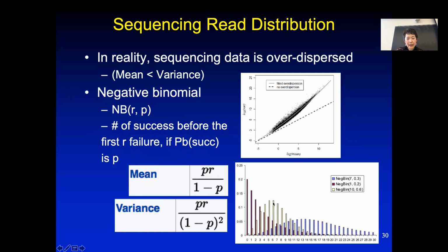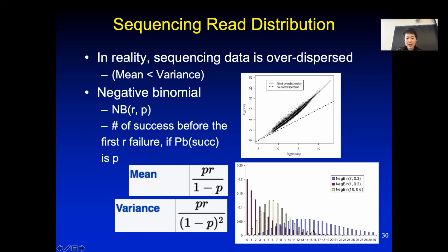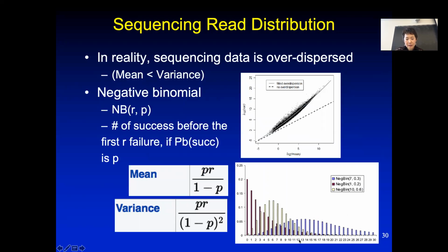And so if we look at this again, compared to the previous figure in here, you can see here when the lambda is 1, this is the mean, and this is like this. But you can see here when the negative binomial, you know, r and p are like this, the spread is already higher, right? But when it's 10, you can see this spread is much, much bigger compared to like this, right? Oh, so actually this is not the mean. Yeah, if the mean is 10, actually the spread also would be higher.